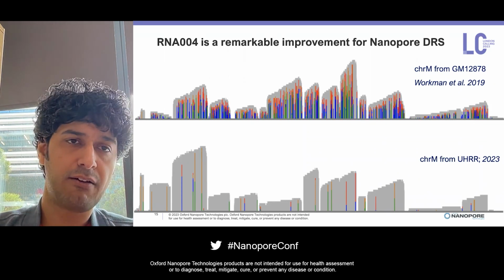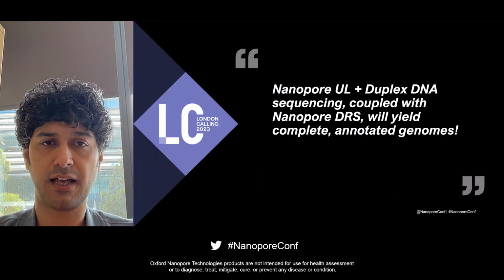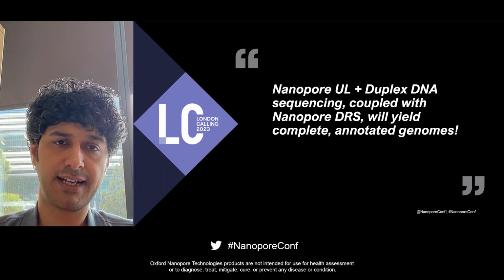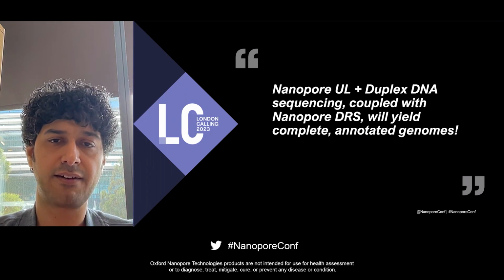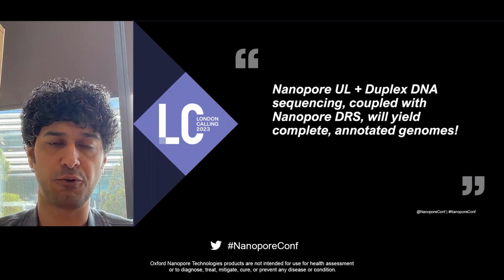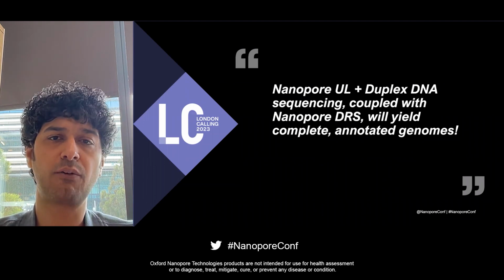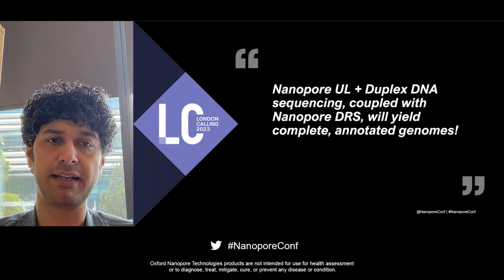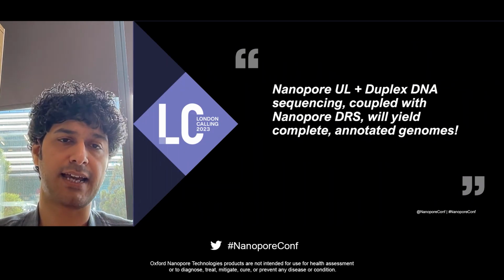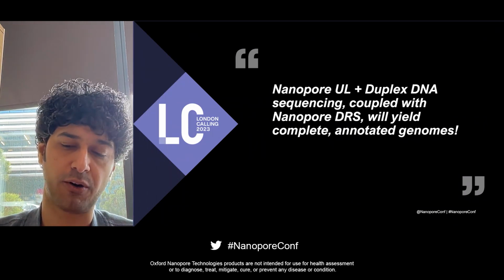So in summary, combining the Nanopore ultralong and Duplex DNA with this fantastic update on direct RNA using RNA004 has been very exciting. We have various assembly and transcriptome experiments underway, as have many other groups in the field. And we are excited that this combination will yield very high quality annotated complete genomes, both human and non-human. And this is a very exciting development for us as academicians working with the platform.